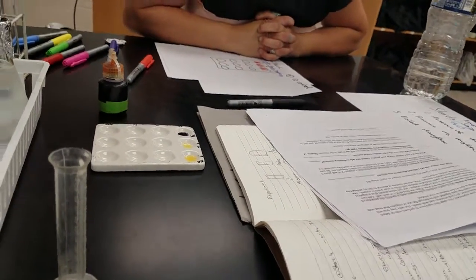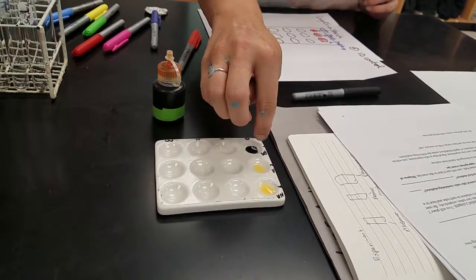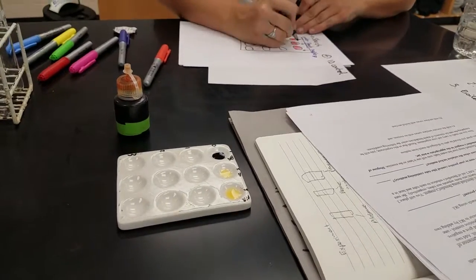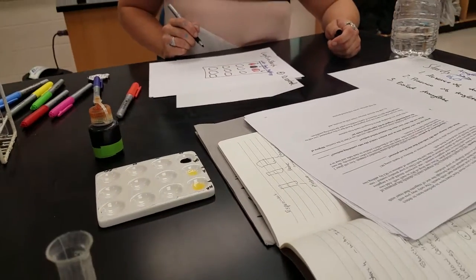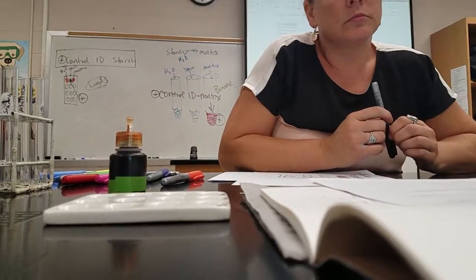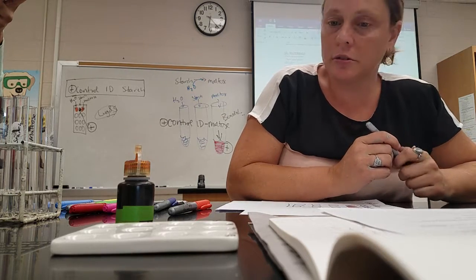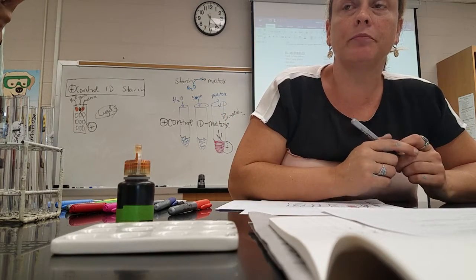Okay, you see which one is different. So that is starch. This was water or maltose, and this was water. We're just gathering information that we have identified starch is going to change black. That's your positive control. So this turned orange. If it's staying orange, it means there's no starch there. If it's black, it means that there's starch. So we're going to use that information in our experiment.